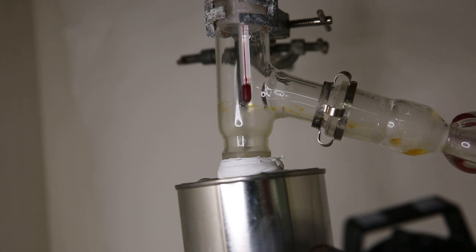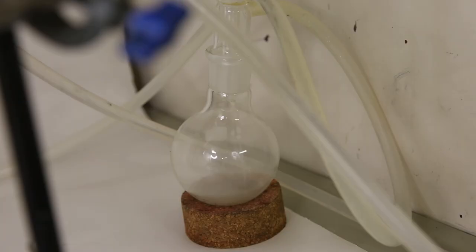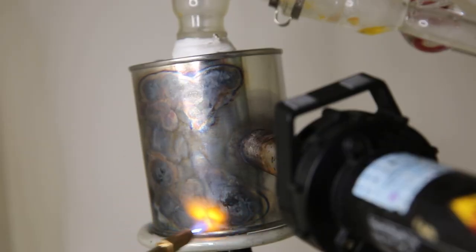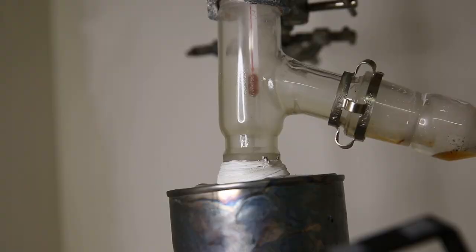After a while some vapors start to come over and we can see an orange liquid condensing. We can also see a stream of vapors and some orange liquid flowing into the receiving flask. Since the reaction is going pretty slow I help it with another torch and put a heat gun against the side of the can. We can see that it has an effect and a lot more vapors start coming over. It also went a little bit crazy but it's not much of a problem.